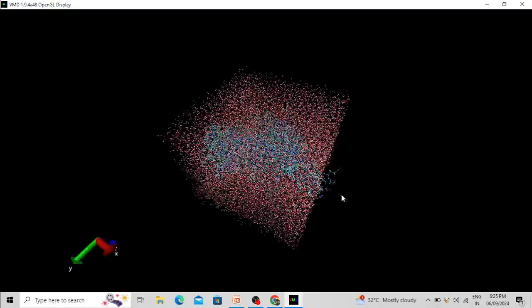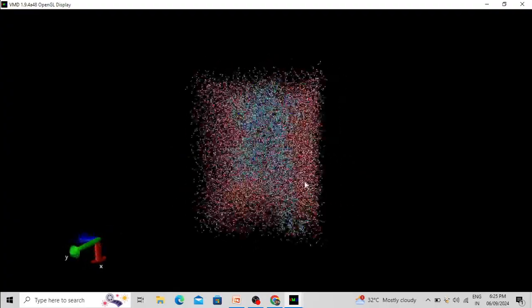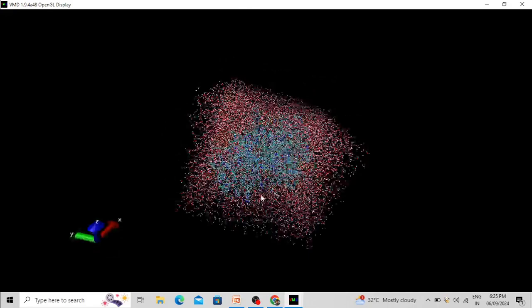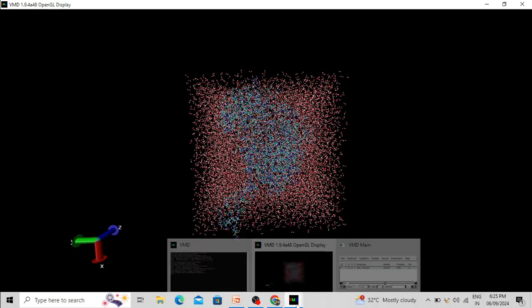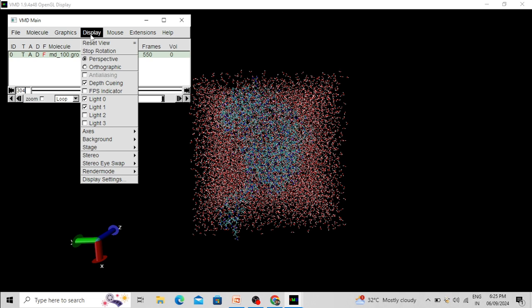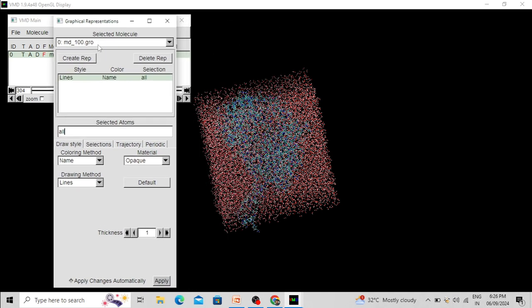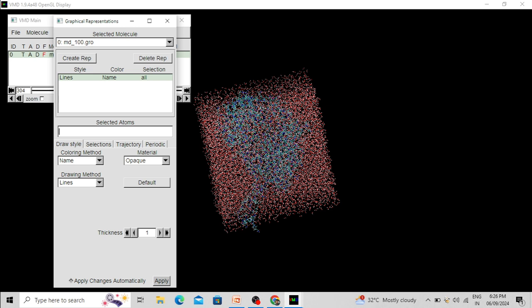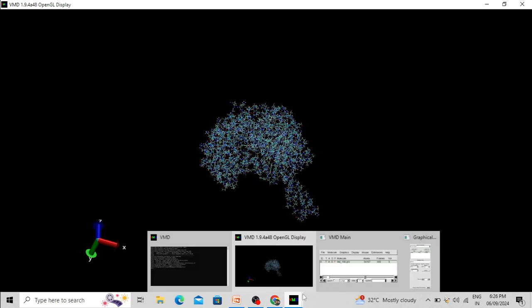Now you can modify the structure. For example, suppose you don't want to retain the water molecules — you can remove them, remove other ions, or retain only the protein molecule or ligand molecule. First let's change the perspective view to Orthographic view by clicking Graphic Representation. I want to retain the protein molecule, so type 'protein' and click Apply. Now only the protein molecule is present.